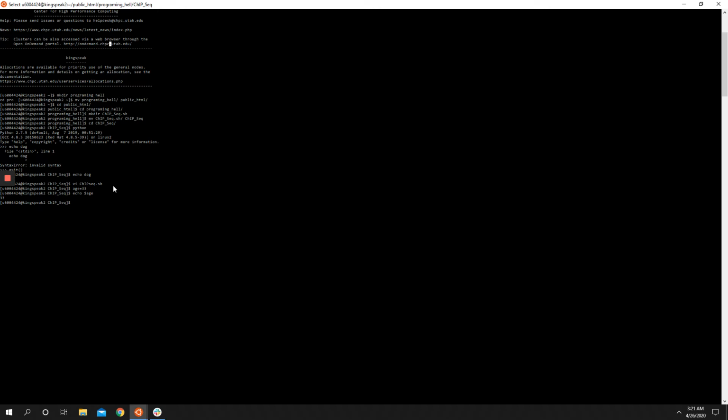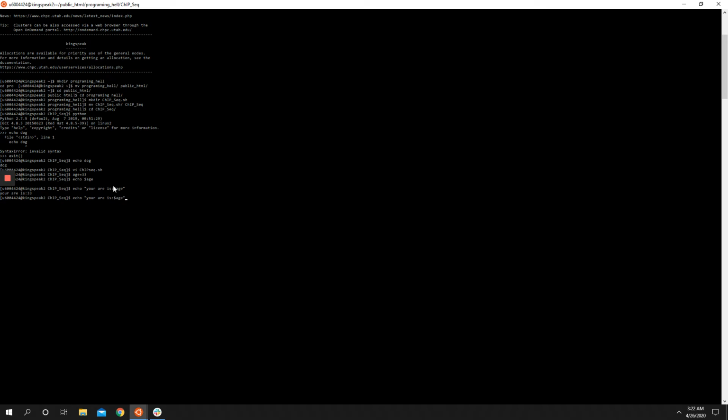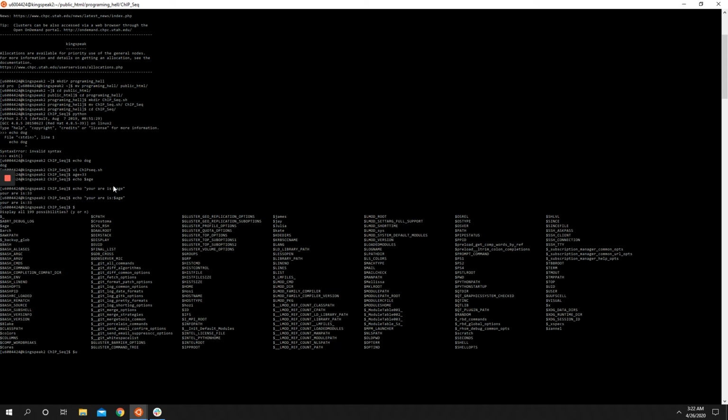So then I can make like a short script, and I can say echo your age. Age is $age, and now it says your age is 33. So anytime you see that $ sign in a word, that's a variable that's either set by you or set by some other program. And if you ever want to see a list of all the variables, if you just hit $ and hit tab twice, those are all the variables that are set right now.